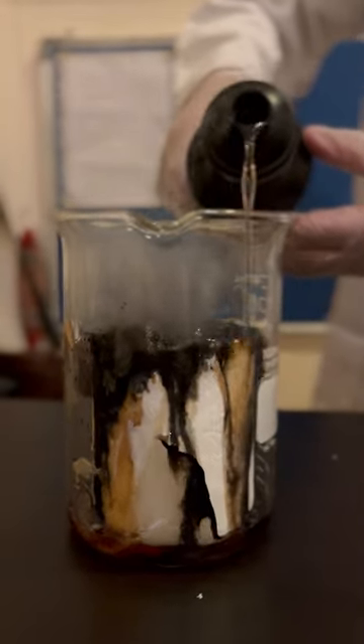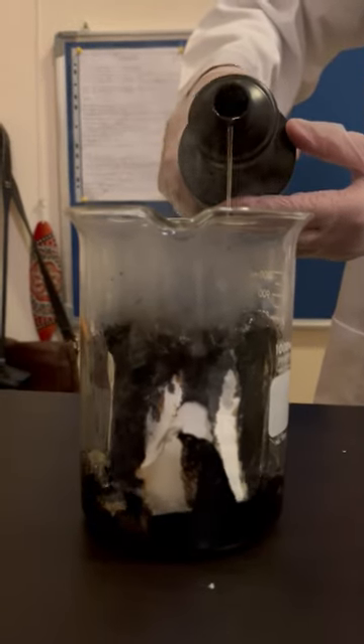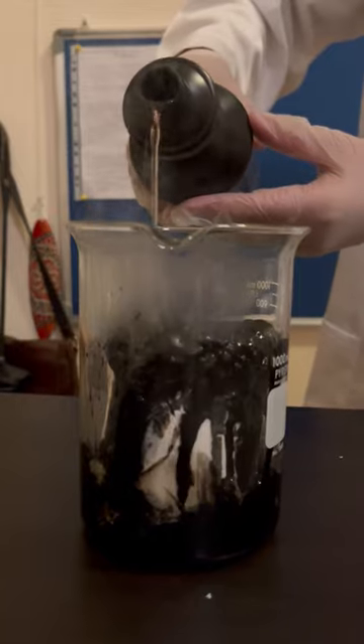Toilet paper is made of cellulose, which is a sugar. When I add the sulfuric acid, it removes the water molecule from the sugar and leaves the carbon behind, giving it this charred effect.